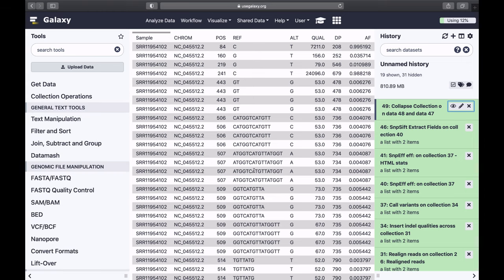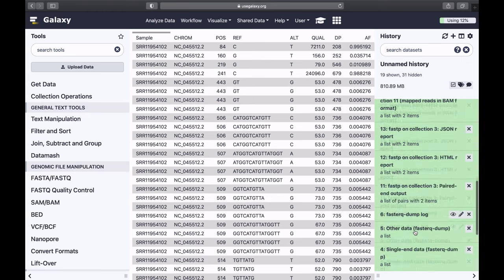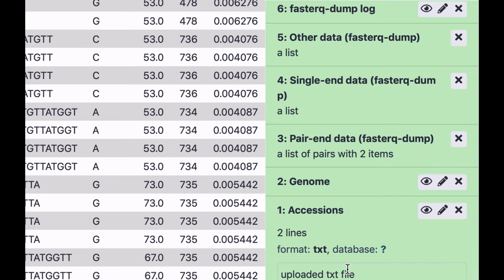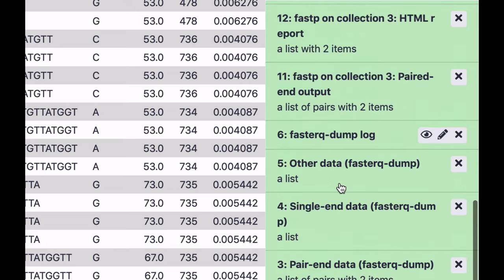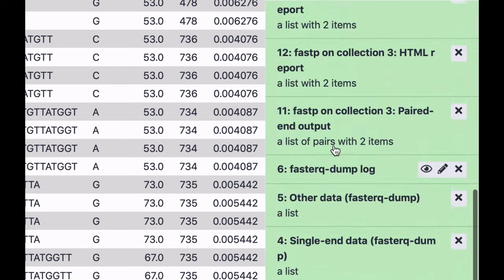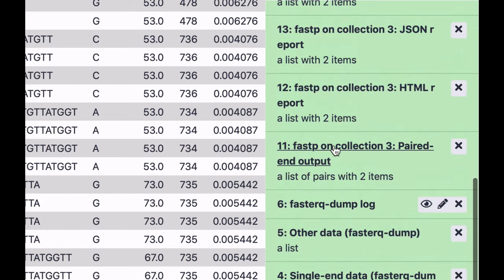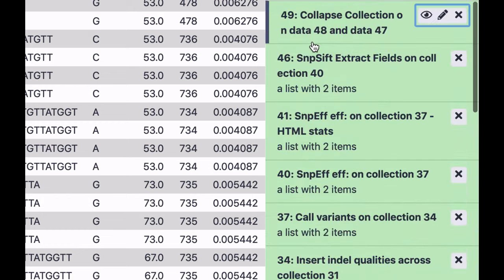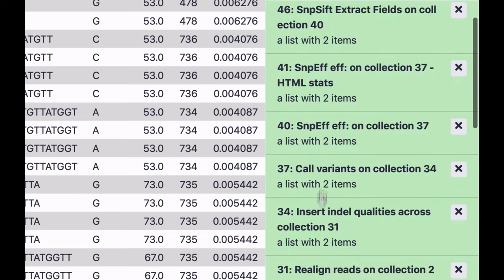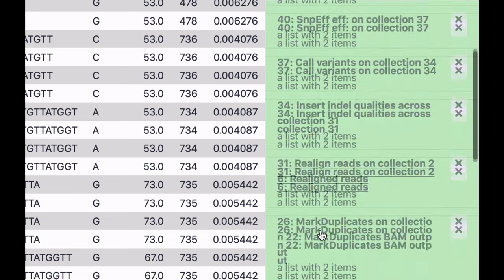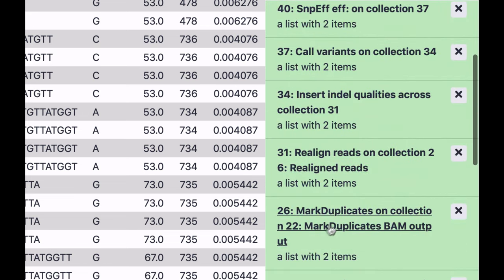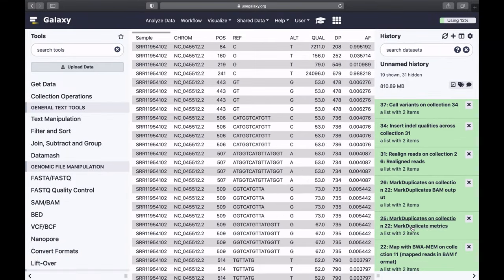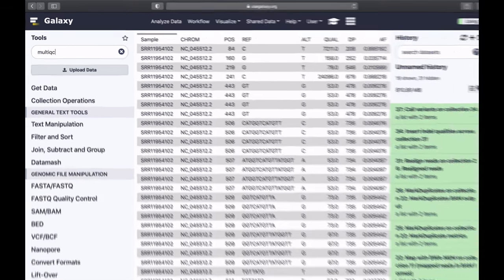At several points in this tutorial, we generated some summary statistics, logs, about the data that we have. First, this log is, the first such log, for example, is this JSON file generated by FastP. And the other one is the marked duplicates output, marked duplicates metrics. We can use two of these summary statistics data sets to paint a picture of how good our data is. And for this purpose, we're going to use MultiQC tool.